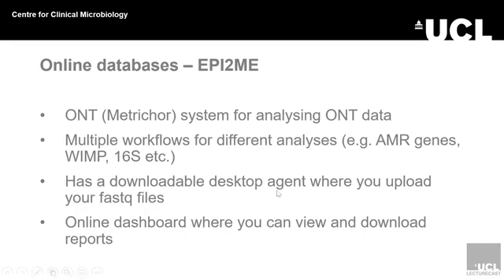So you download a desktop agent, which is where you then put your Fastq files. You can just put your raw Fastq files into Epi2me, and that's what's really useful about it. You don't have to worry about going through processing it all. And then there's an online dashboard where you can view and download the reports and more information about it. So let me show you that.